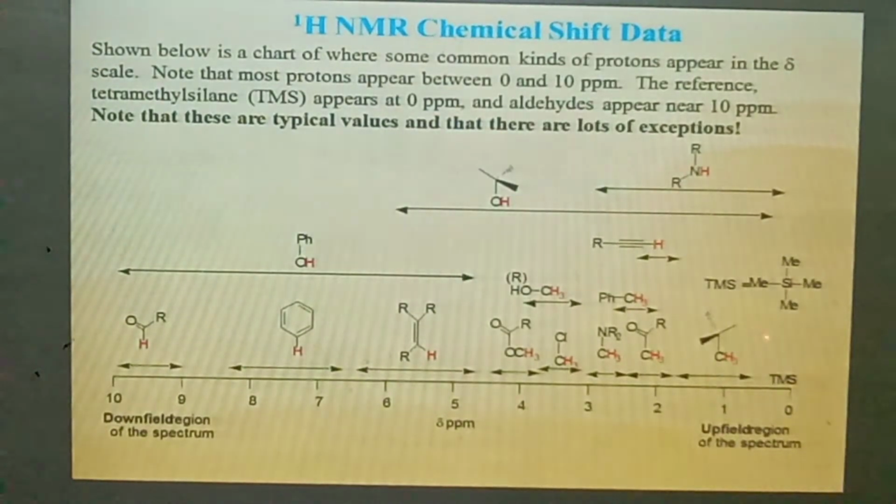For example, the region between 0 to 1 is meant for alkyl groups. Next, if we go to 2 to 3.5, that proton containing carbon, if it is substituted with halogens, ketone, ester groups or OH, a downfield shift occurs for the alkyl group because of the electron withdrawing effect exhibited by the halogens as well as these functional groups.